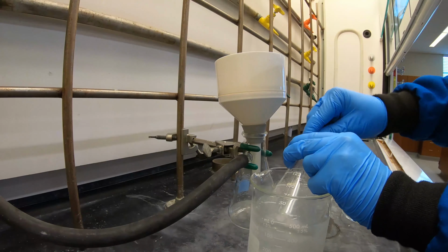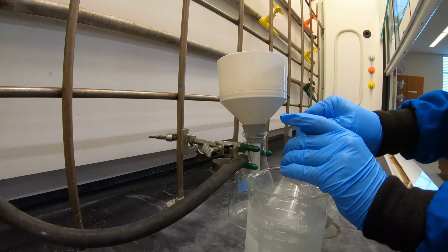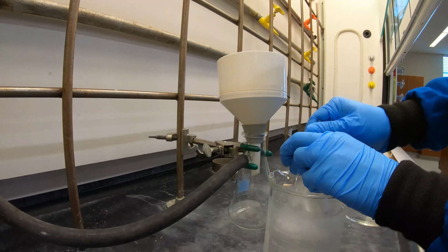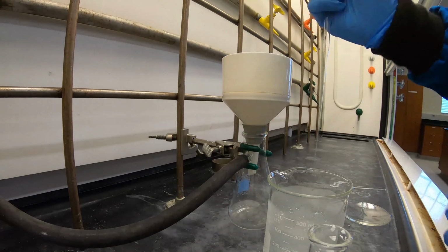Use your glass stir rod to induce recrystallization. Feel free to add ice to help in recrystallizing your aspirin product out of solution. You should have a large amount of product crash out from the ethanol recrystallization. While waiting for it to crystallize, set up your vacuum filtration system.